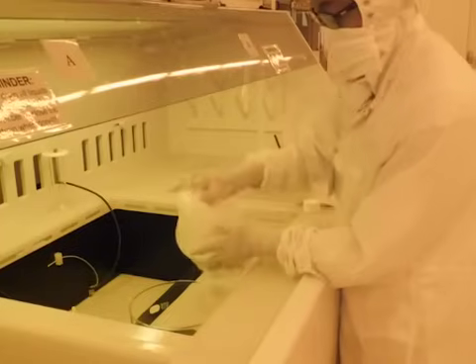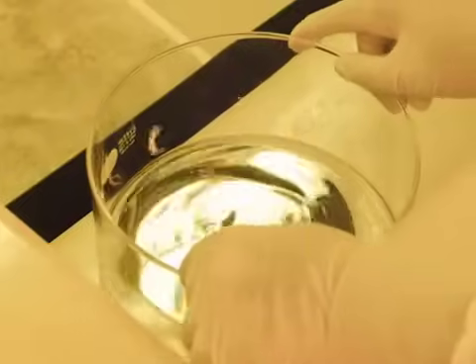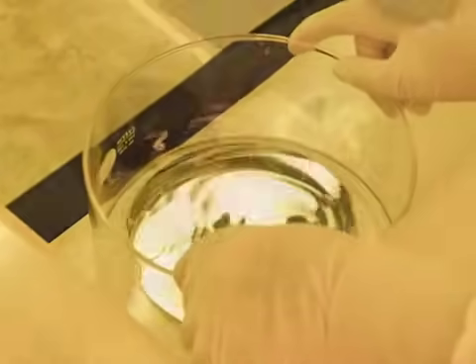The soluble regions of photoresist are removed using a developer solution specific to the type of photoresist used. Finally, the wafer is rinsed and dried, leaving the pattern photoresist on the wafer.